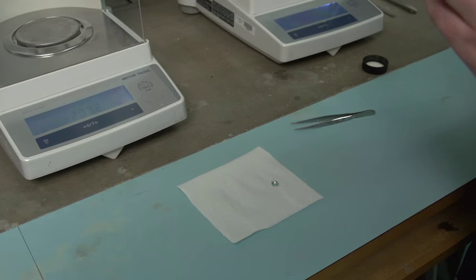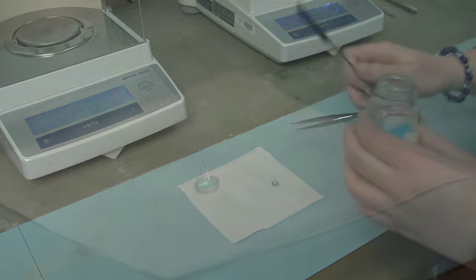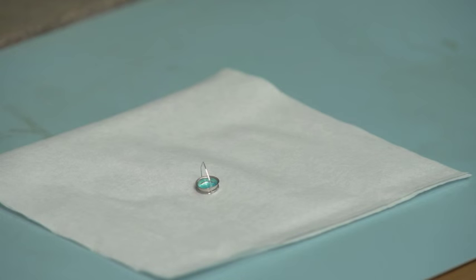If the mass is too small, you can add additional crystals. And if the mass is too large, you can remove crystals by tipping the sample pan and emptying the sample onto a Kim wipe.